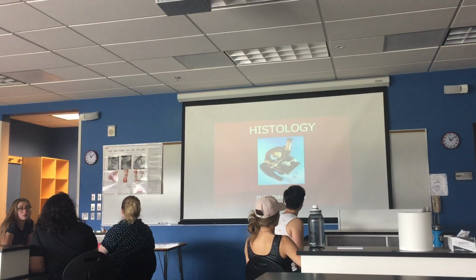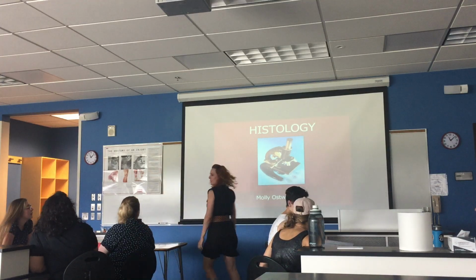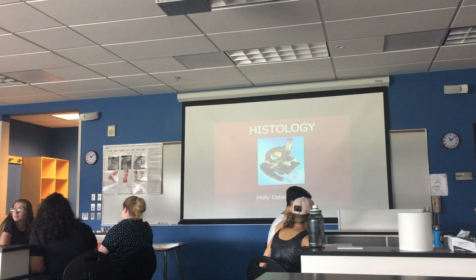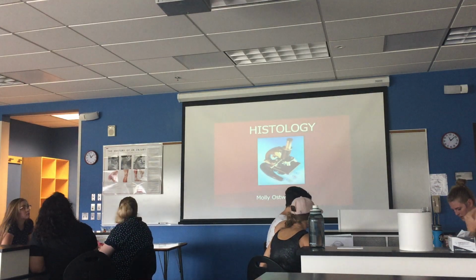Isn't that amazing? Huh? I don't know. Still too bright over there. You guys see, we're going to want some contrast. I like the microscope. We're going to want to see this. Oh, yeah, that's good.